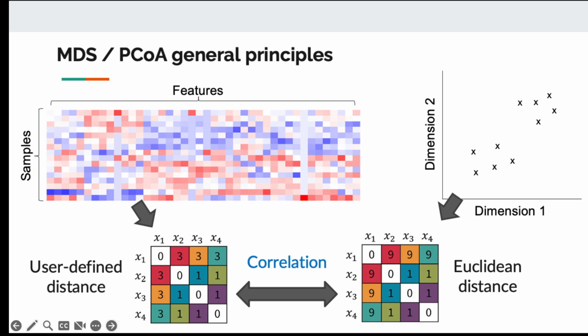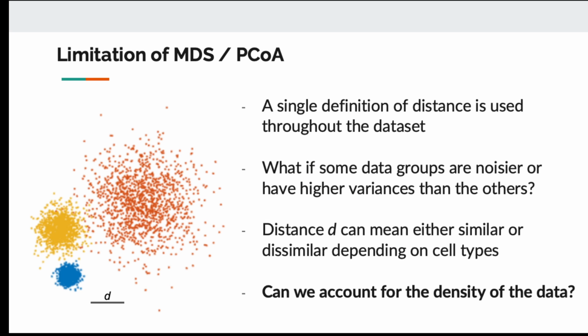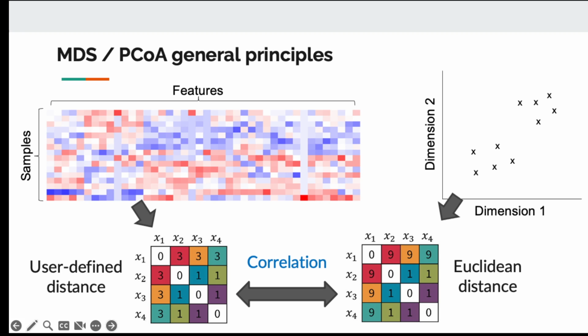If an algorithm can do this, you get a good visualization of the data that preserves whether the samples are near or far from each other, reflecting how similar they are. But the process, whether you use correlation, maybe Pearson correlation, Spearman correlation, and the algorithm to find the position of the cells or the samples on the screen, differ from technique to technique, but the ideas are all the same. They want to optimize the similarity between the distance that your eye can see versus the similarity that you calculate from your data. We are not going to go into how they actually calculate it, and that might be too difficult. But this idea should give you inspiration that this is a process that is natural and can be done.